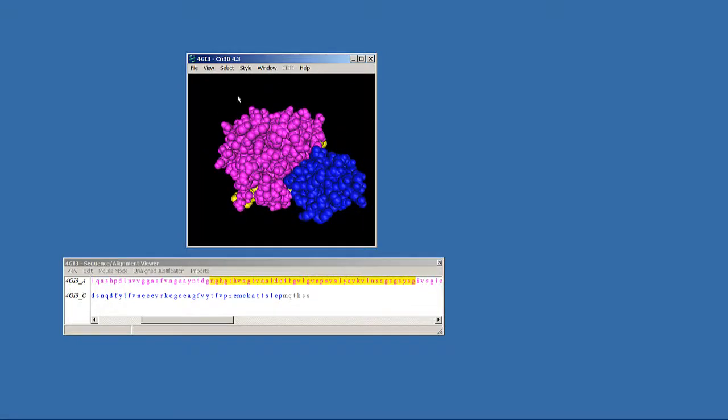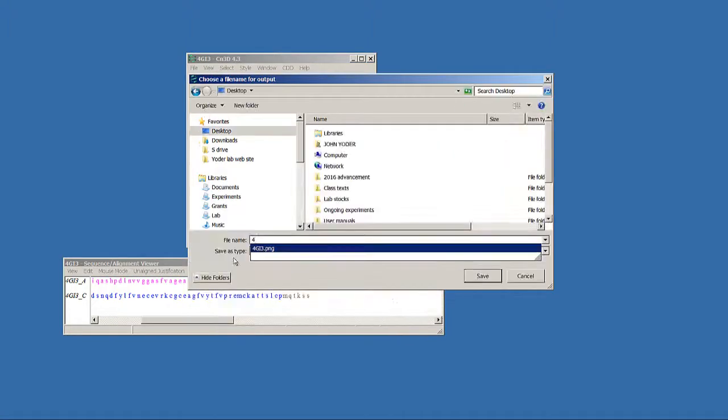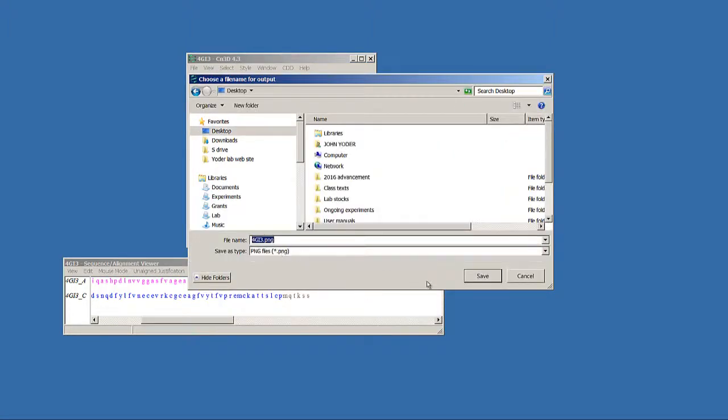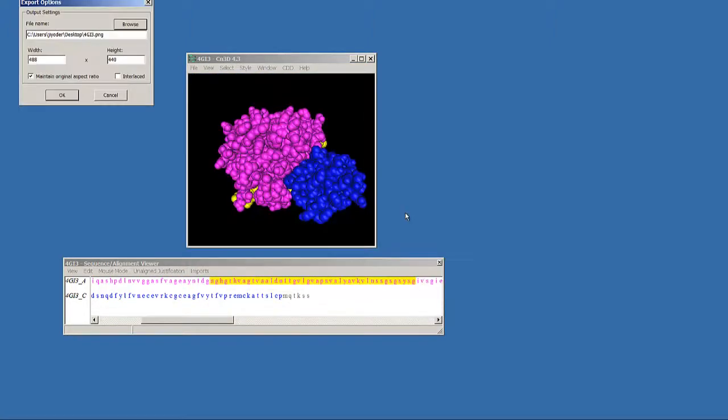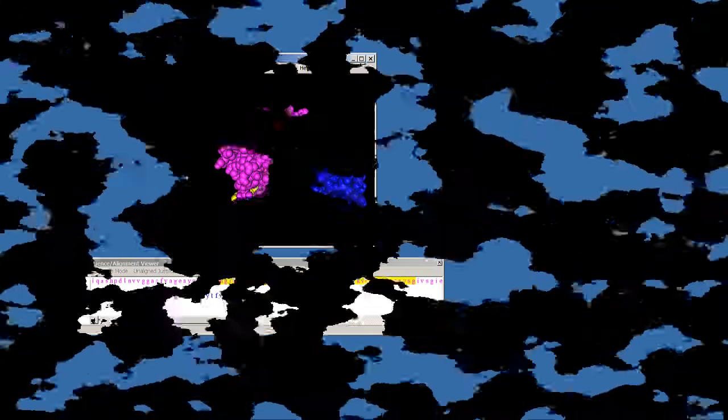Use a different style for each of the four structures, and save using File Export PNG. There should be four PNG files, each with a different structure, formatted in a different style. Attach these to your homework assignments, and that's it for this week.